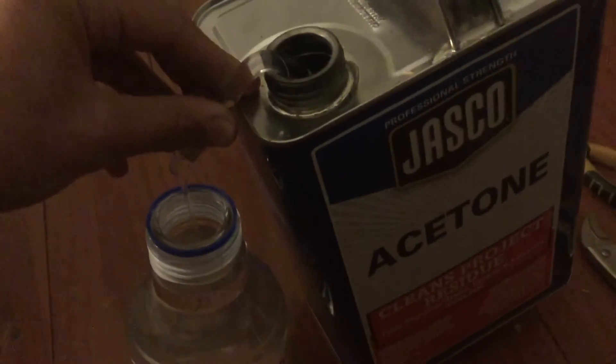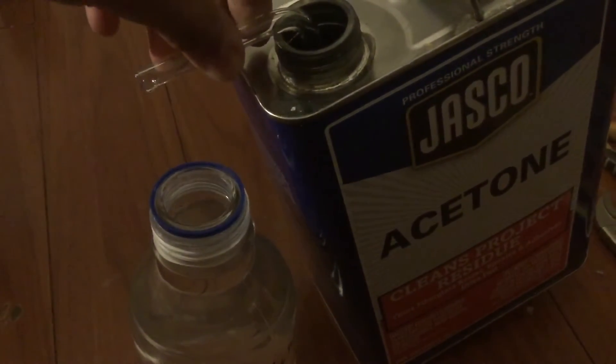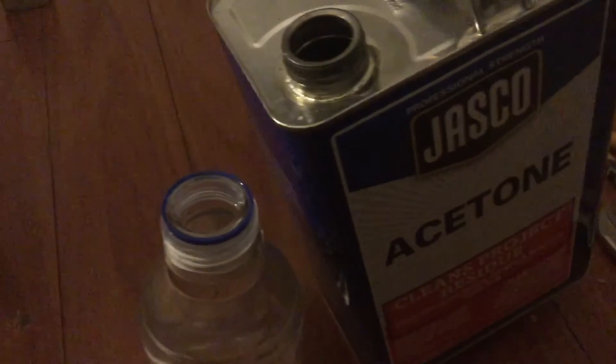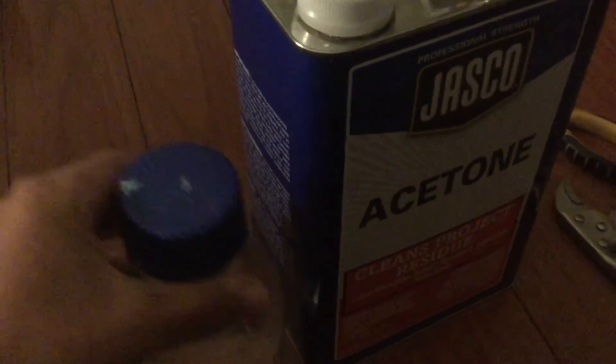Once you're done removing your acetone, you can simply tip the tube back and there it stops. Just get your glass tube out and simply cap the acetone can again. And there you go — that's how you can get solvents out of one of these cans that dribble everywhere, without dribbling everywhere.